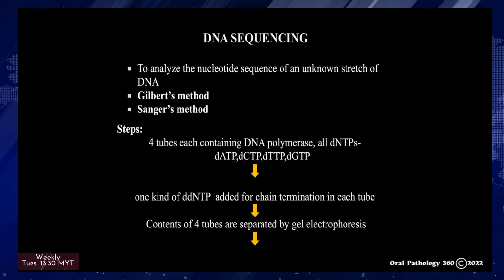DNA sequencing. DNA sequencing is the process of determining the nucleic acid sequence, the order of nucleotides in DNA. It includes any method or technology that is used to determine the order of the 4 bases: adenine, guanine, cytosine, and thymine. Knowledge of DNA sequences has become indispensable for basic biological research, DNA genographic projects and in numerous applied fields such as medical diagnosis, biotechnology, forensic biology, virology, and biological systematics. Comparing healthy and mutated DNA sequences can diagnose different diseases including various cancers.